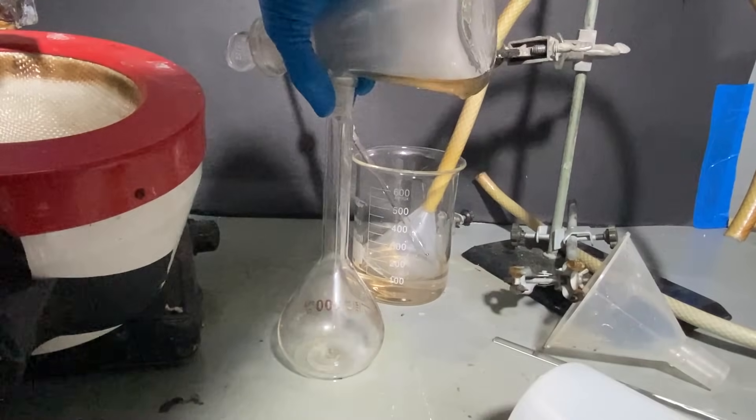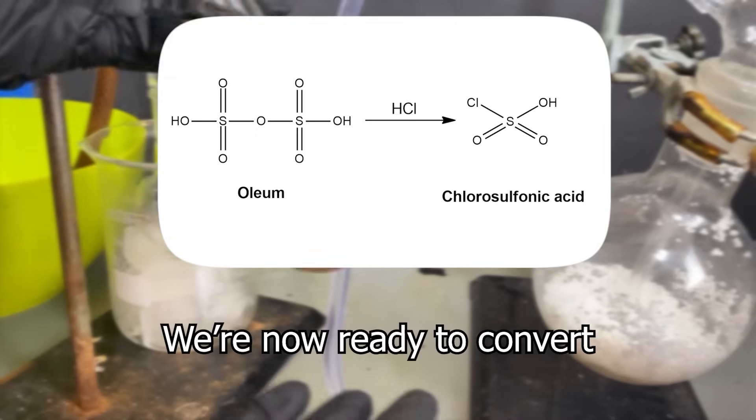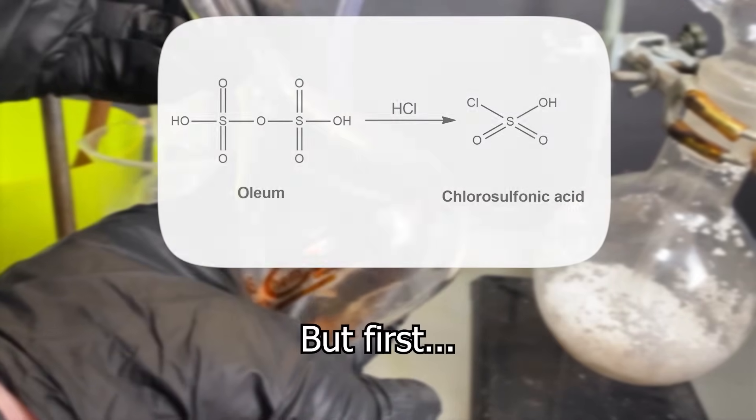I've tilted the condenser so that the oleum could flow all the way into the receiving flask. After all that, I moved the oleum into a volumetric flask for storage. We're now ready to convert the oleum into chlorosulfonic acid. What even is chlorosulfonic acid? Well, some could say it's a really quirky chemical, because it's classified as a superacid.